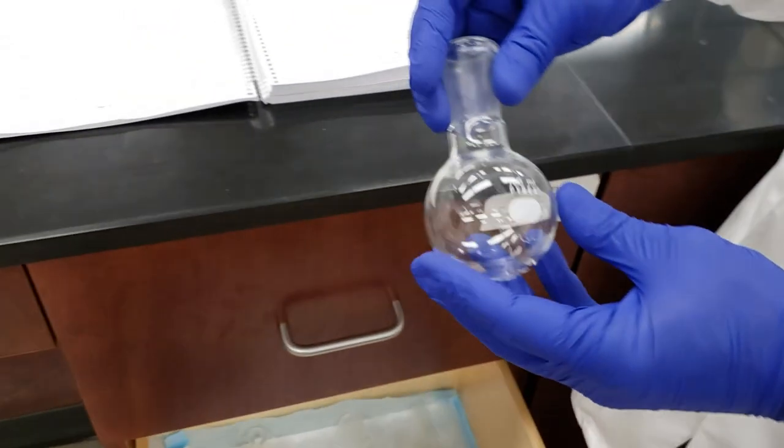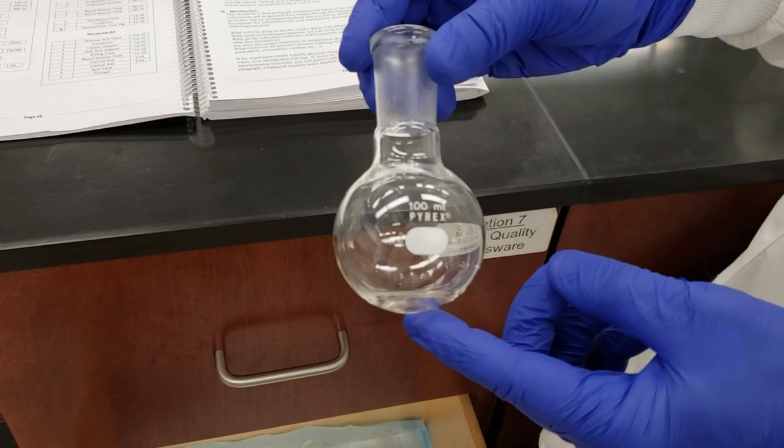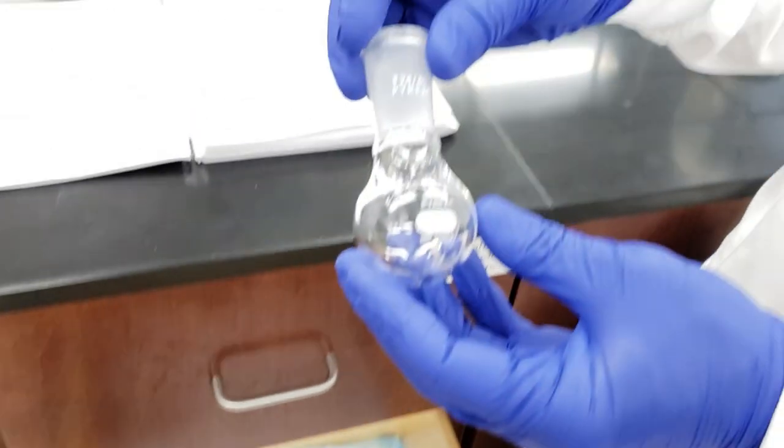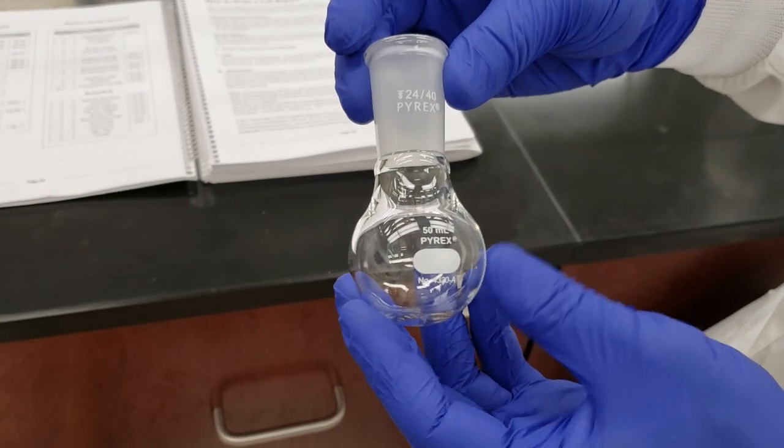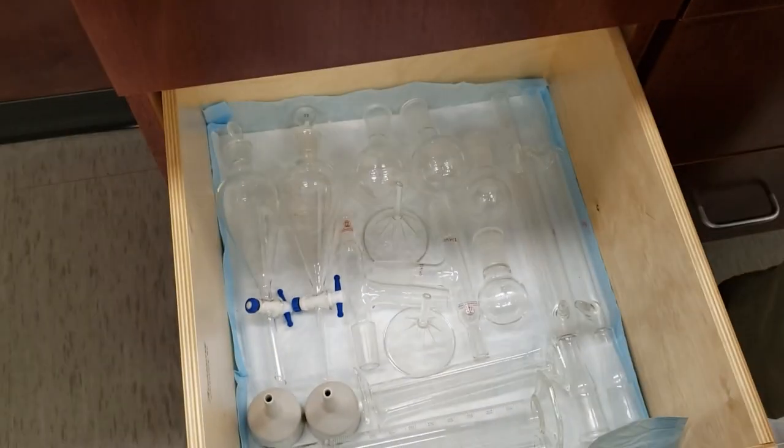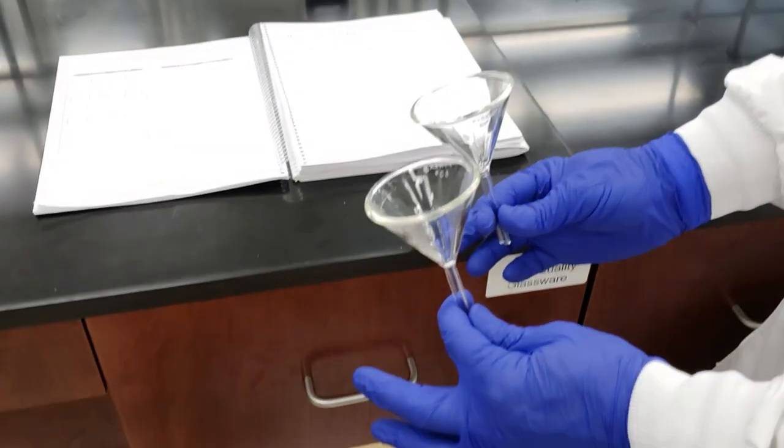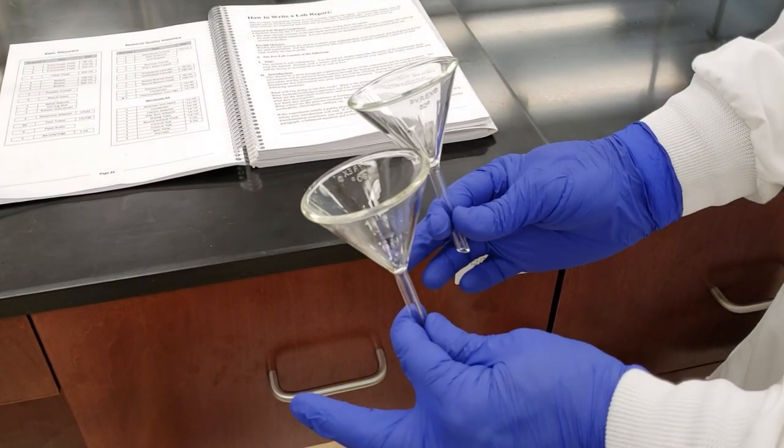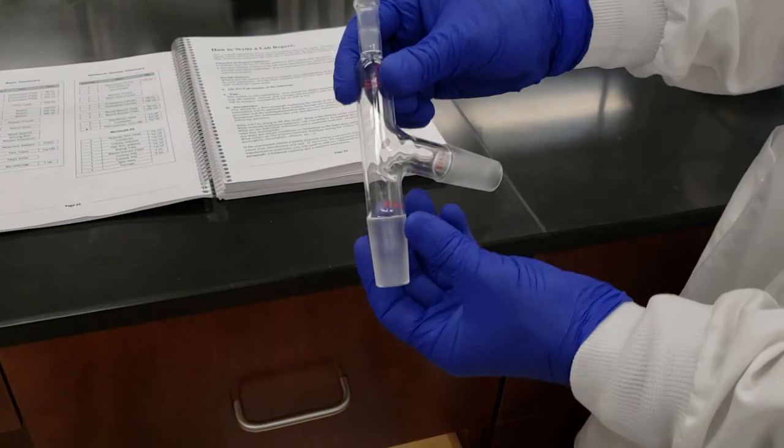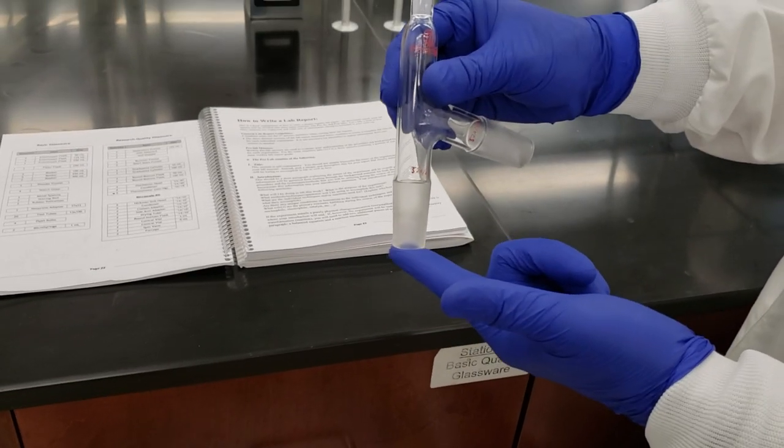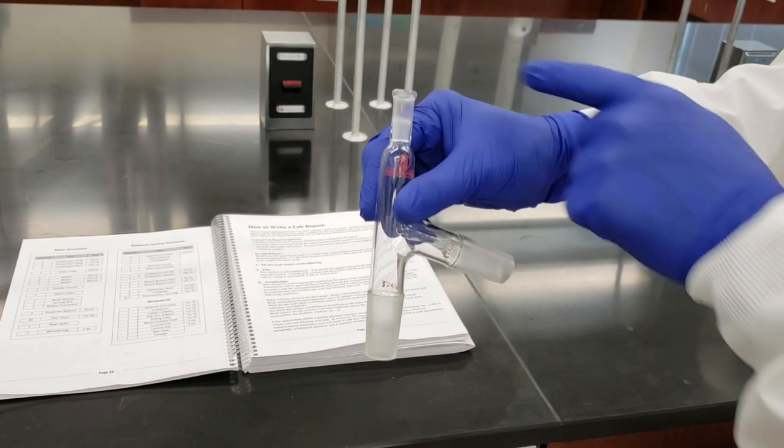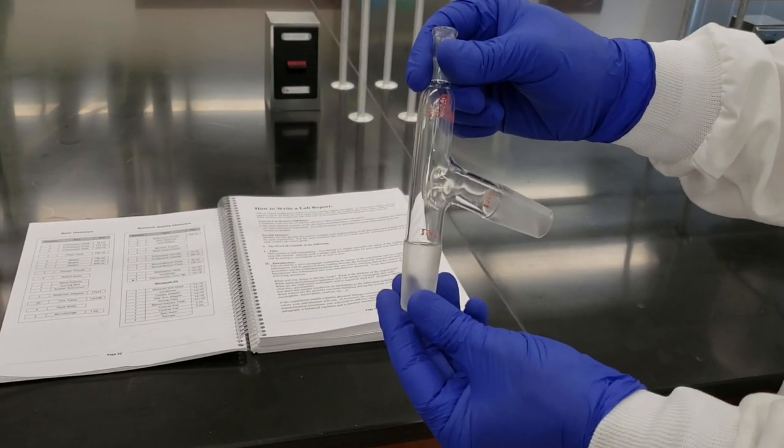We have two 100 mL round bottom flasks and two 50 mL round bottom flasks with 24/40 ground glass joints. We'll use these for boiling, distilling, refluxing, and a variety of uses. We have two short stem funnels for adding acids and bases to reaction mixtures. We have two distillation heads that attach to a boiling flask, connect to a condenser, and hold a thermometer for distillation and other applications.